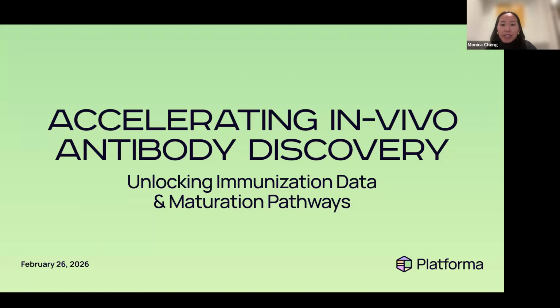We're excited to have you today for our webinar, and we have a really exciting topic on antibody discovery. In the past, we talked a lot about in vitro using display technologies, but today we're shifting the focus to in vivo, which is really the gold standard when you're talking about biological nuance because there is no technology out there that is smarter than your own immune system.